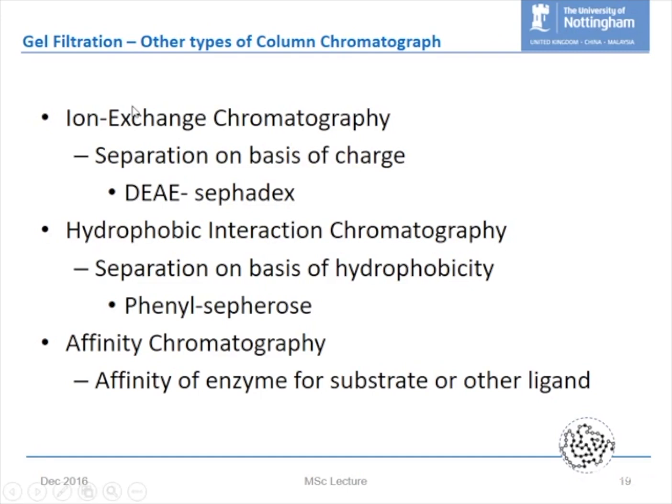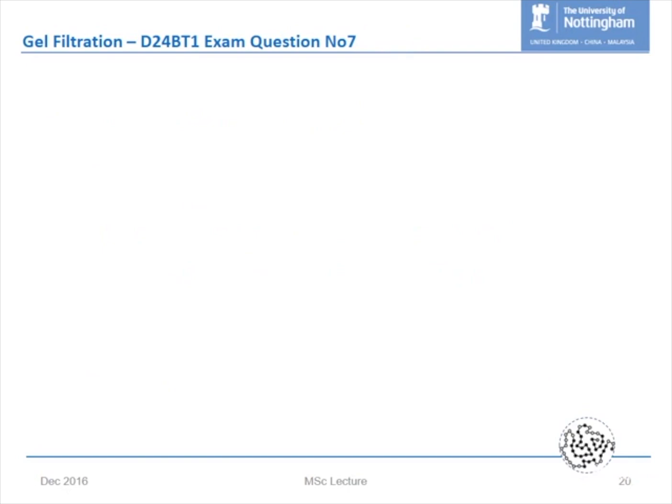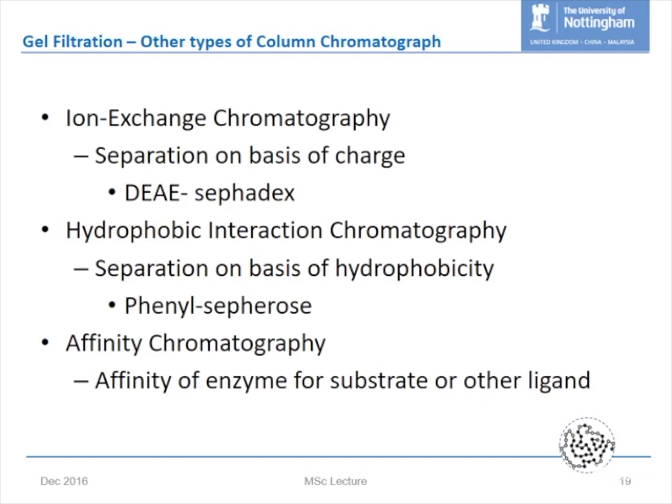So there are just three types of different chromatography that are available. So that's gel permeation chromatography. Hopefully you understood the basis of what we're talking about there.